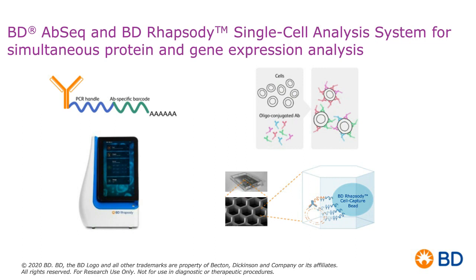And if we don't have a fluorochrome on there to light up to tell us it's FITC CD4, what we've done instead is put an oligo tag on here, and there's a specific barcode or sequence that tells us this is a CD4. Now, it would be cute if the oligo sequence actually spelled out this is a CD4, but it is not. But instead, our bioinformatic pipeline can say that if I capture this antibody attached to this oligo, it was a CD4 antibody that must have been bound to a CD4 protein.